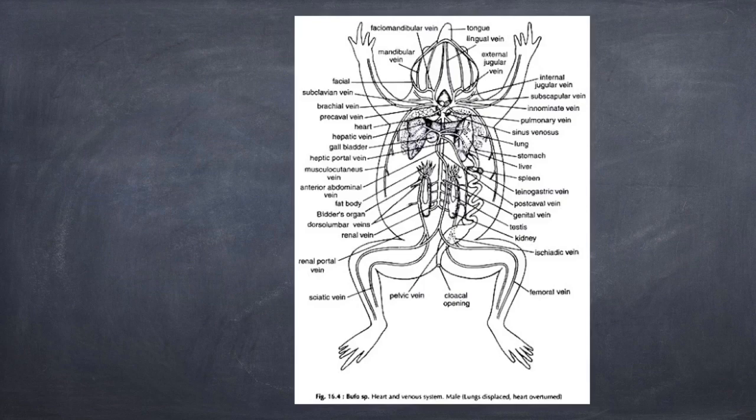Next part is the spleen. It is a rounded, dark red gland embedded in the mesorectum, and the mesorectum is the mesentery which suspends the large intestine to the dorsal body wall. Next to it is the kidney. It is a flat, elongated organ, dark brown in color.